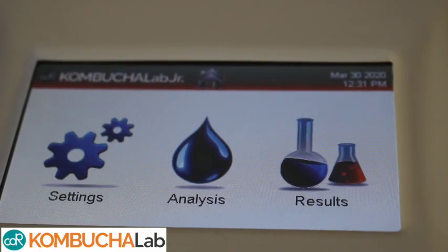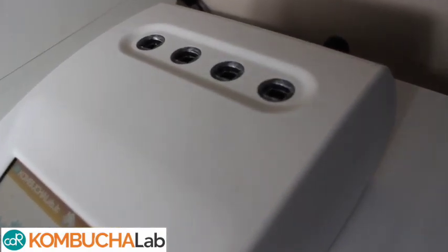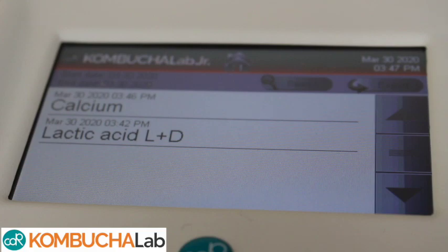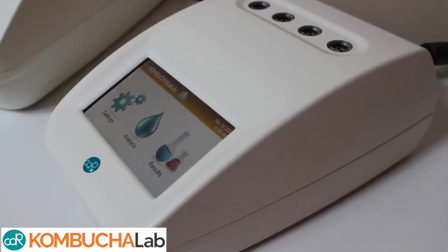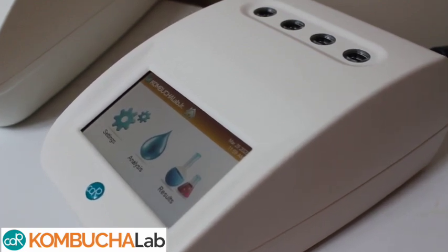And then there's the Kombucha Lab Junior, which is another great option, as it can run up to three samples at a time and can be programmed with analyses of your choice. And although it doesn't have a printer, it still stores the results, which can be exported to a computer. The Junior version also has a lithium-ion battery option if you need to test on the go.